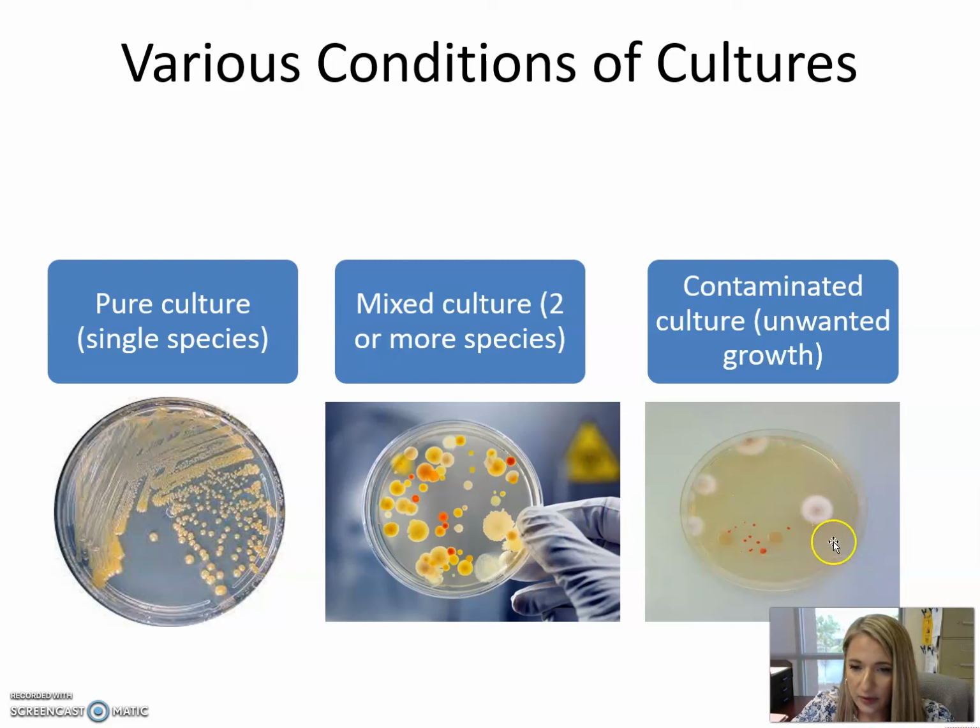Then over here, we have what we call a contaminated culture. The main thing with contaminated cultures is they contain unwanted growth of some kind. So likely this individual is trying to grow these bacteria here, and if we look, we can see what appears to be this fuzzy growth, which is typically consistent with fungi. It looks like some type of airborne contaminants got in and continued to grow. So contaminated cultures just contain any type of unwanted growth.